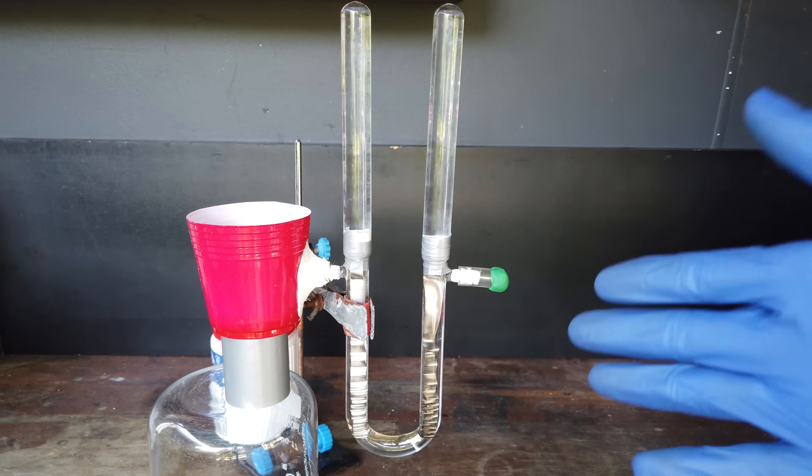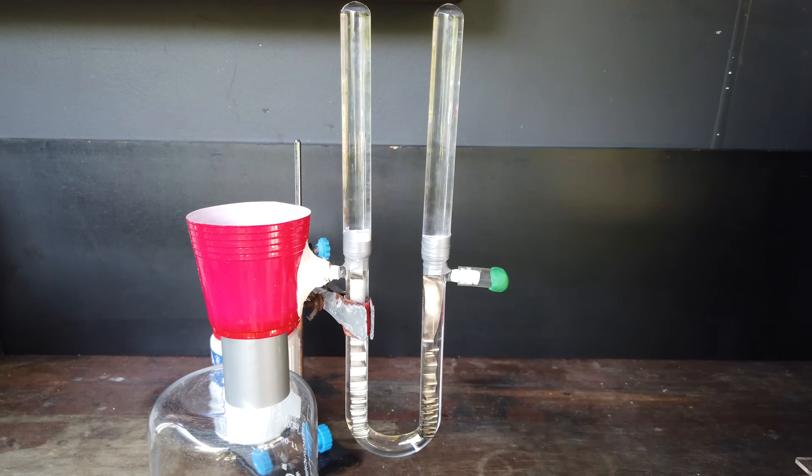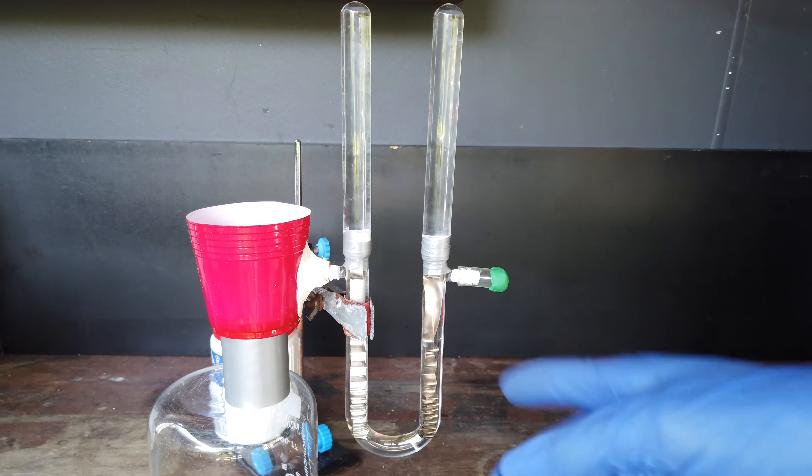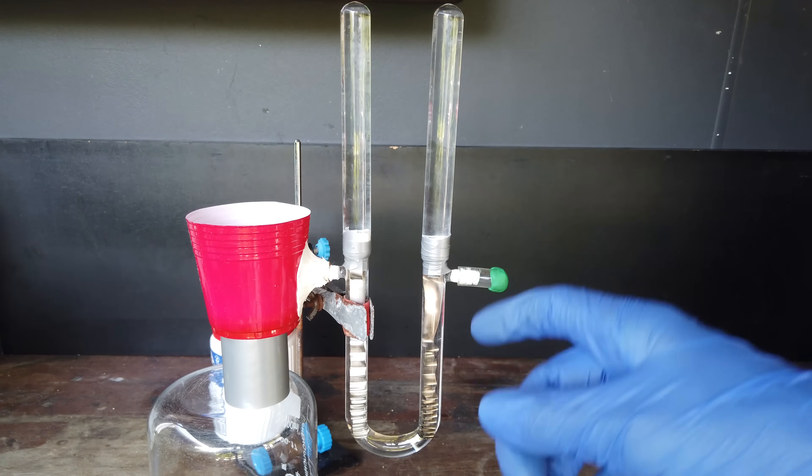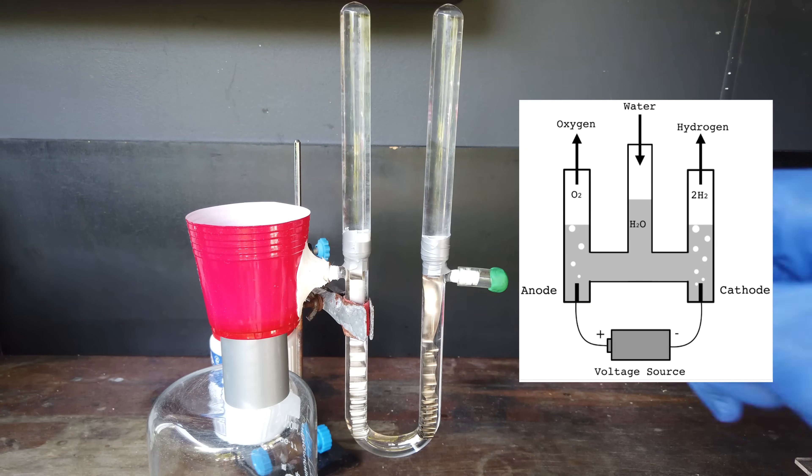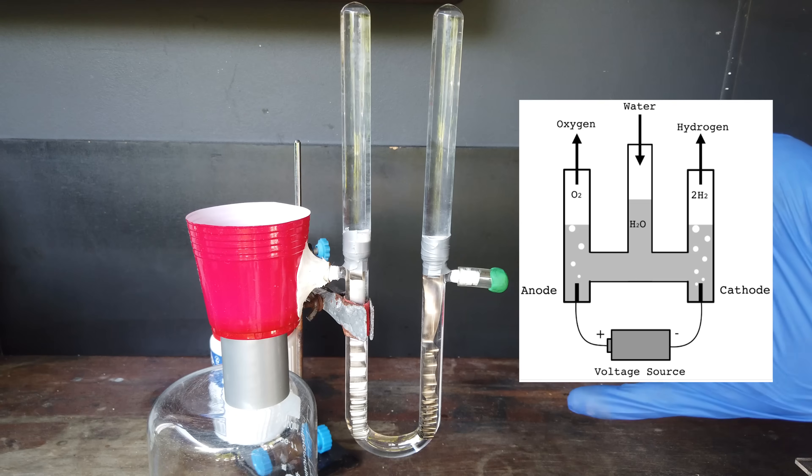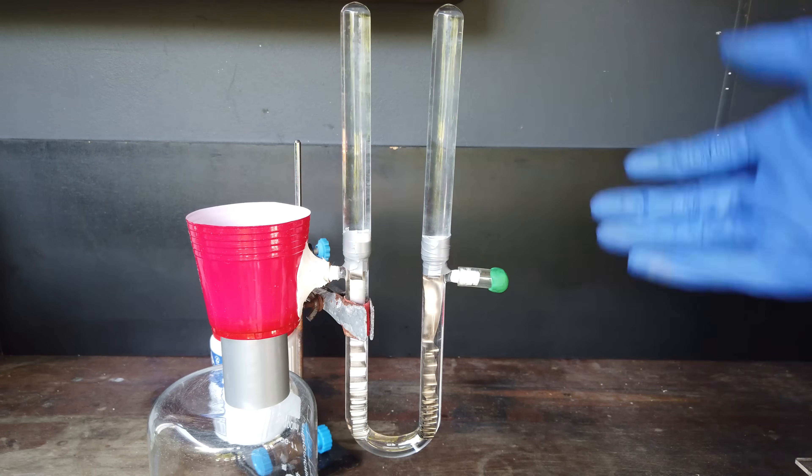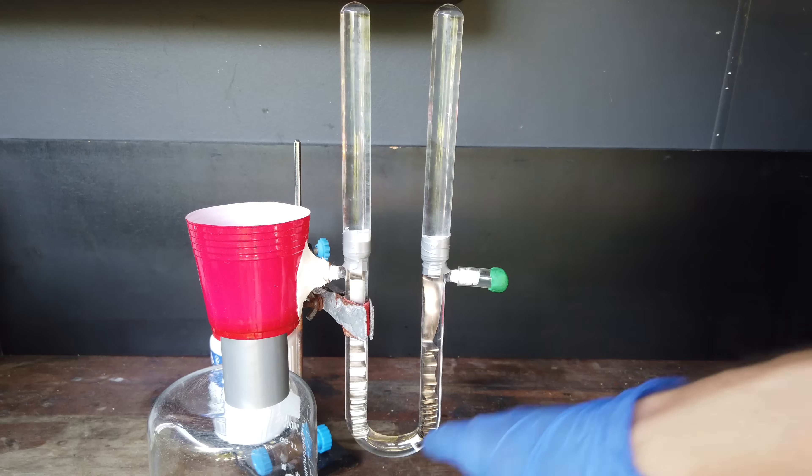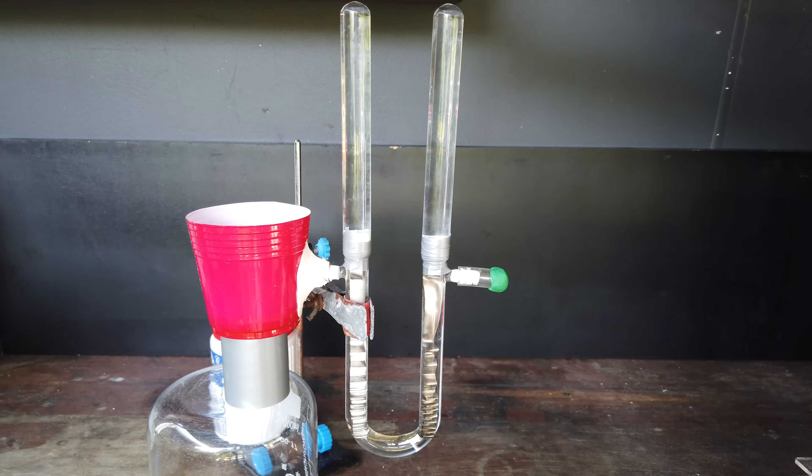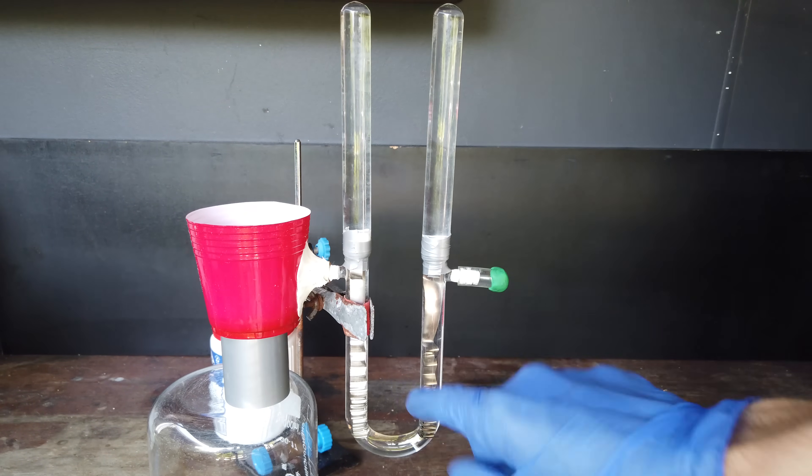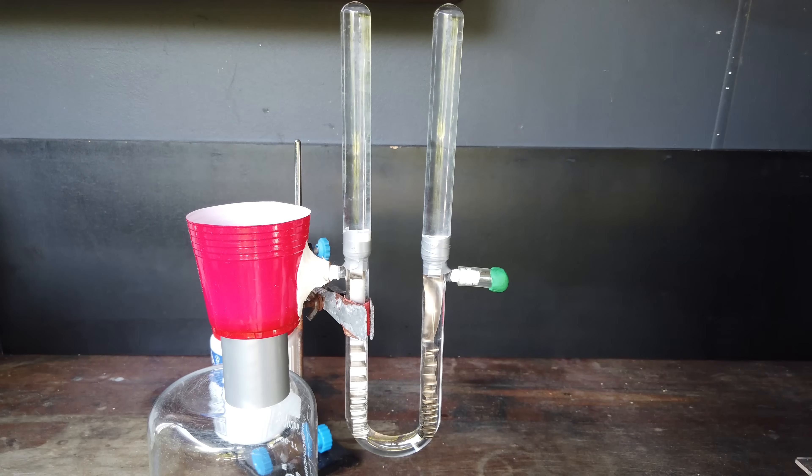So I've redesigned our electrolysis apparatus once again. You can see what we've set up is kind of similar to what's known as a Hoffman voltameter, which is a common high school electrolysis demonstration piece of glassware, where we have our two electrodes, and then the gas is collected in glass tubes positioned directly above our two electrodes there.